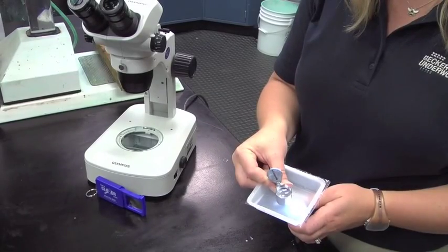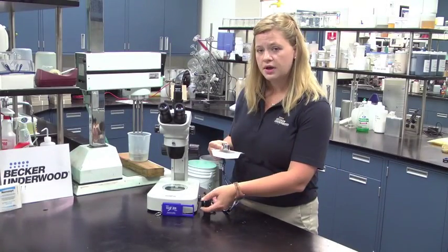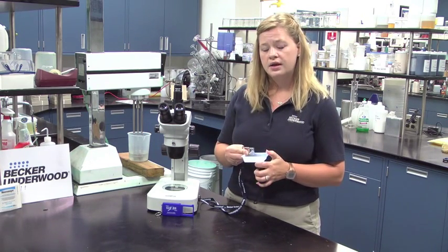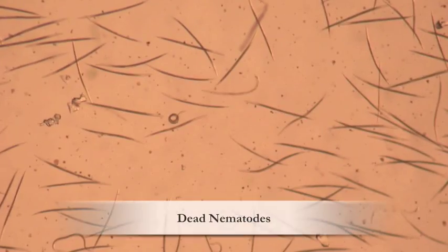Take your hand lens and get it very close till it's almost touching the solution. Next put your flashlight underneath the dish to illuminate the nematodes. Then bring your eye to the hand lens. This will bring out the nematodes. Nematodes should be squiggly but never straight.